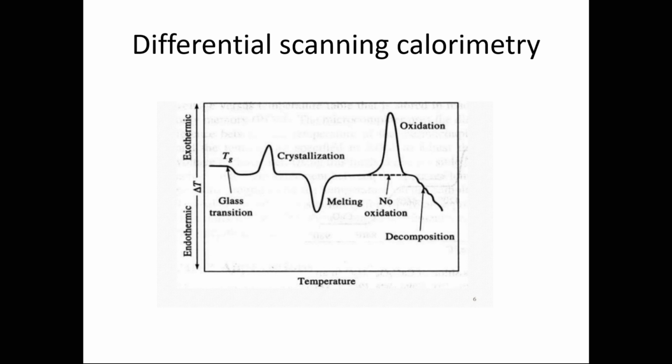What you need to pay attention to is this axis. Specifically, all DSC thermograms must show the direction of events. For example, in this case, you see that exothermic events are shown upwards. So all the maxima on these curves, like these two, are exothermic, and endothermic events are shown downwards. So this minimum is endothermic.